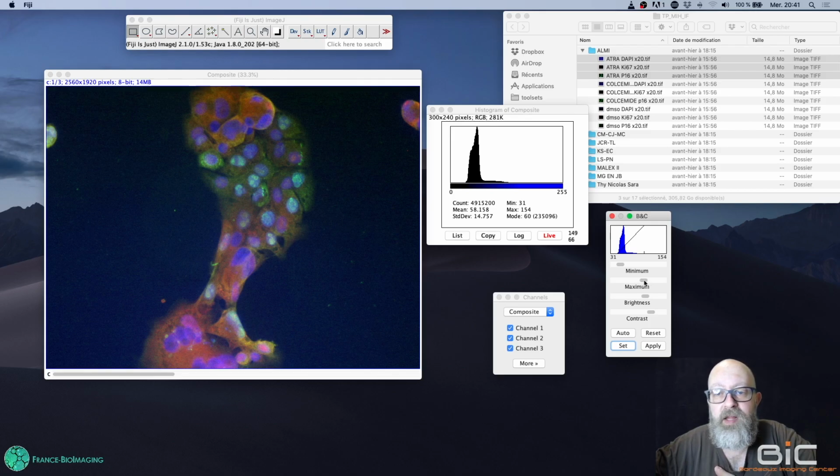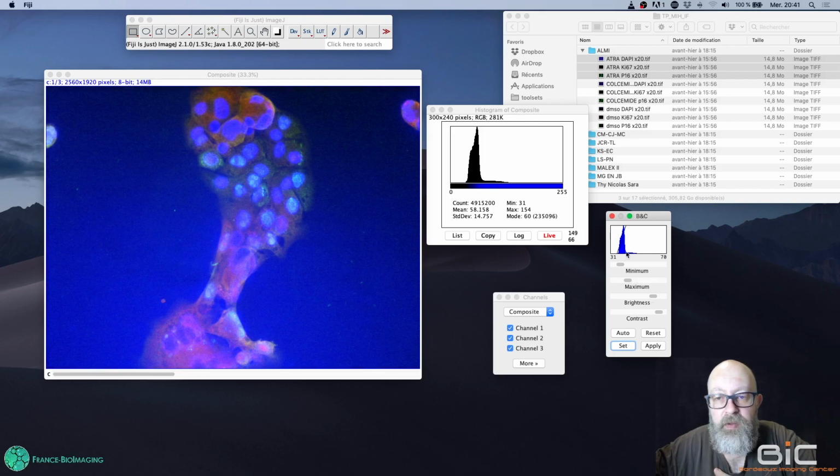You may ask, what happens if I lower the maximum? Well, if I lower the maximum, this value, 70, is the new bright blue. And after this bright blue, there is nothing left. There are no even brighter blues. So all the intensities from 70 on will appear with the maximum value. And this will generate something that is called saturation over your image.